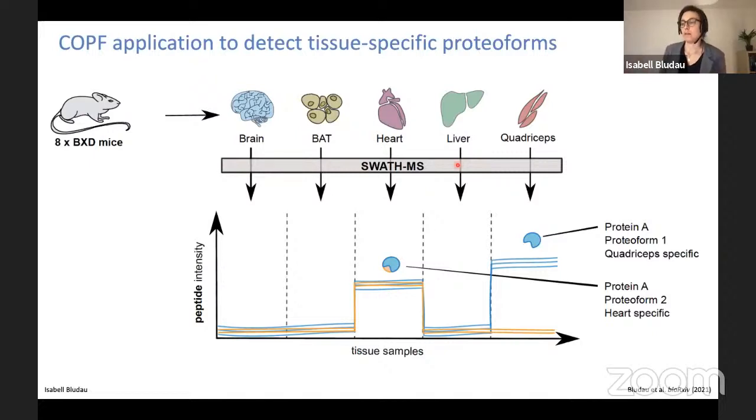And one other point from the bioinformatics side. The weak point of the bioinformatics workflow is that you need sufficient resolution to actually be able to derive signals with this.